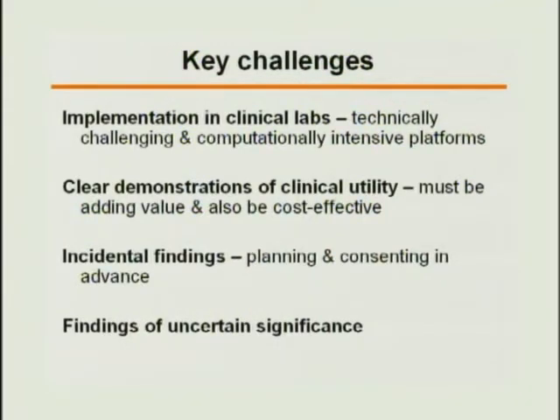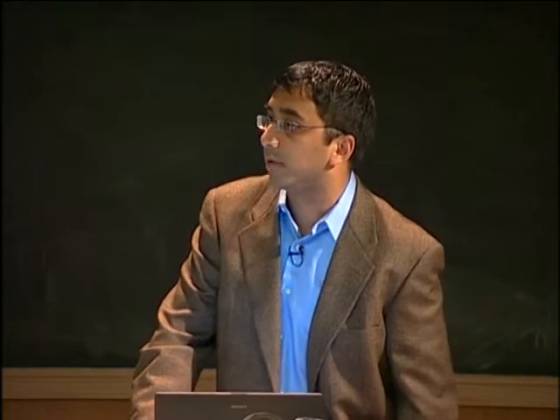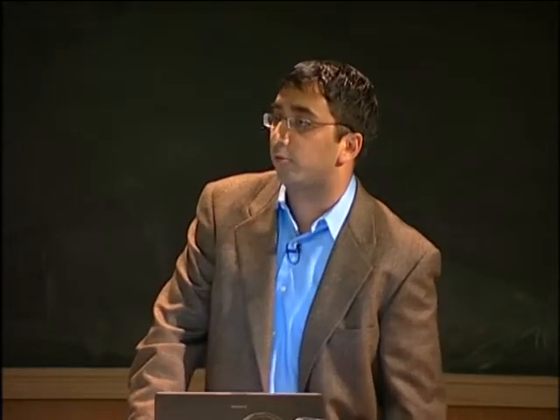These are still technically problematic platforms. They're changing very quickly and becoming more robust, but there's still a lot of issues, and there's quite a bit of computation involved. It's certainly a solvable problem, but I think the critical mass of people who know how to really use these things is still quite small.